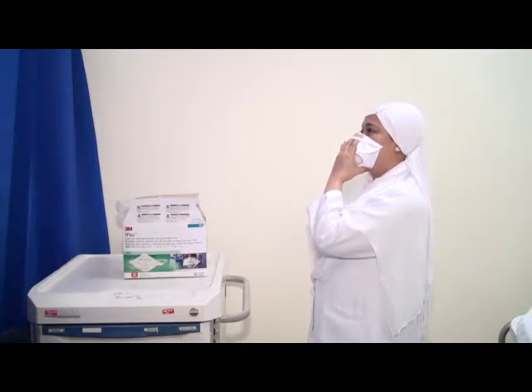Place the respirator against your face with the bottom under your chin and the nose piece across the bridge of your nose. Hold the respirator on your face with one hand and with your other hand, pull the bottom securely under your chin.